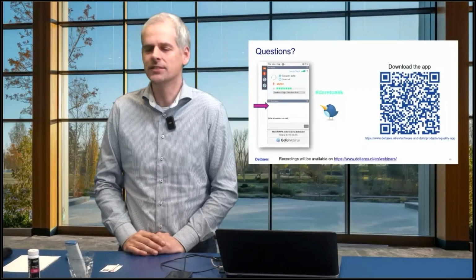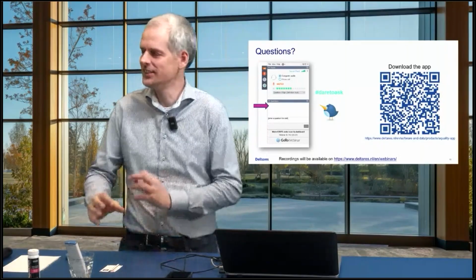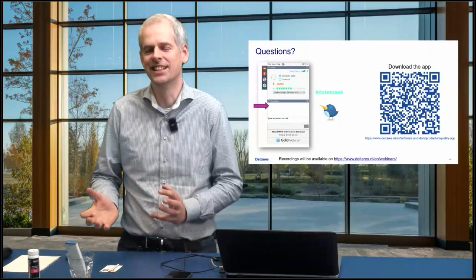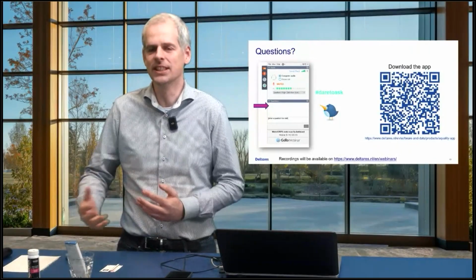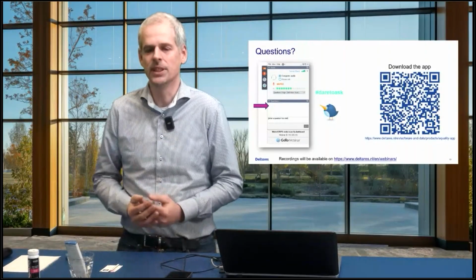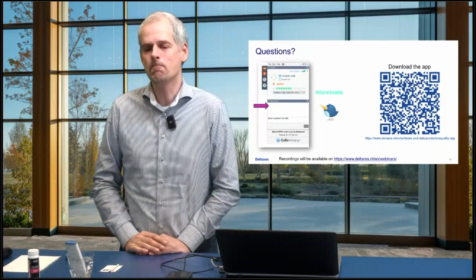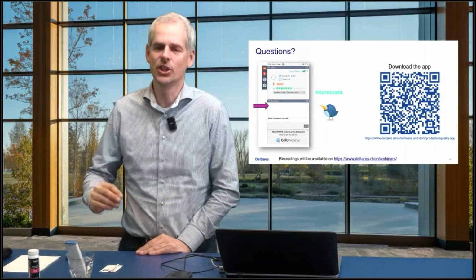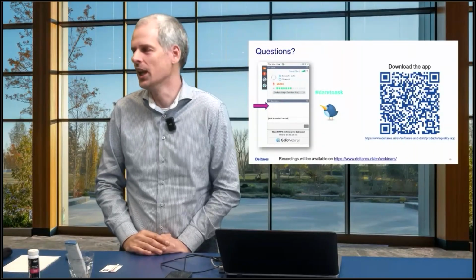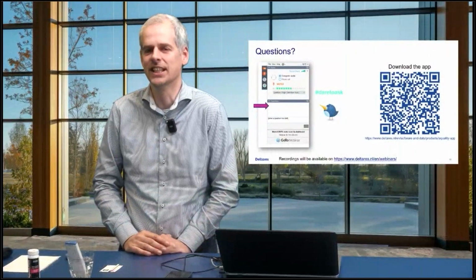We have done something like that based on the coordinates, but sometimes we have different samples very close to each other. If you're within 5 meters, the GPS doesn't really see that you're sampling different water. When you're at a splitting waterway or something, you go wrong with just showing time series based on the GPS locations. So for that, we would like to connect the measurements to locations, but we haven't done that yet.